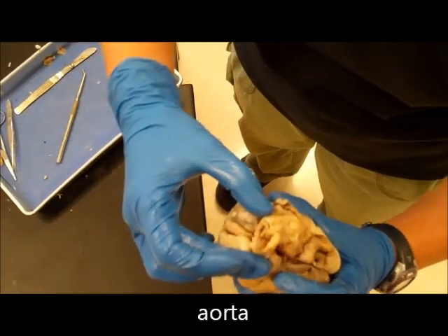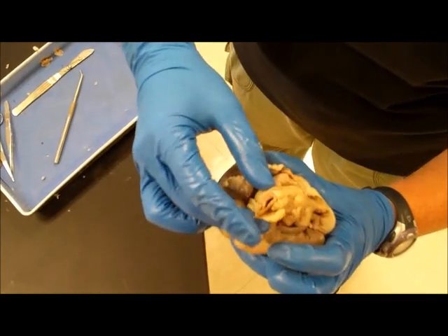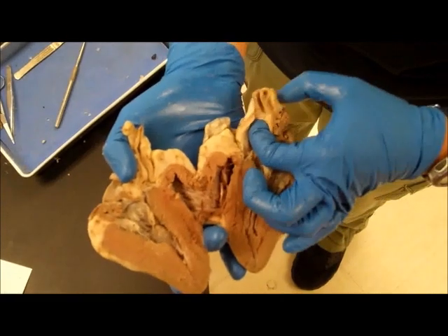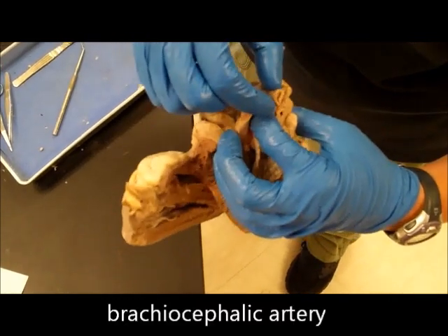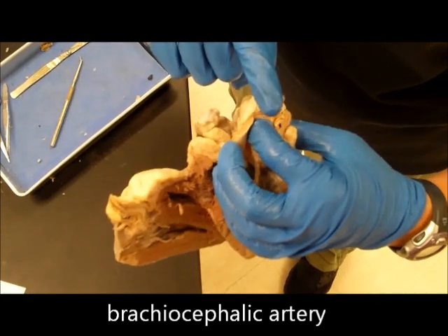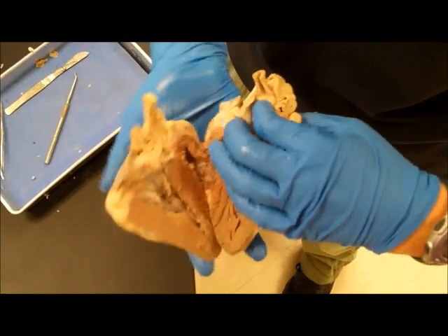So when we bring that heart together, you can see where it forms that tube, that aorta. So again, let's open that heart back up, and we have the aorta, and off of the aorta we have the brachiocephalic artery, which is going to supply blood to the upper extremities.